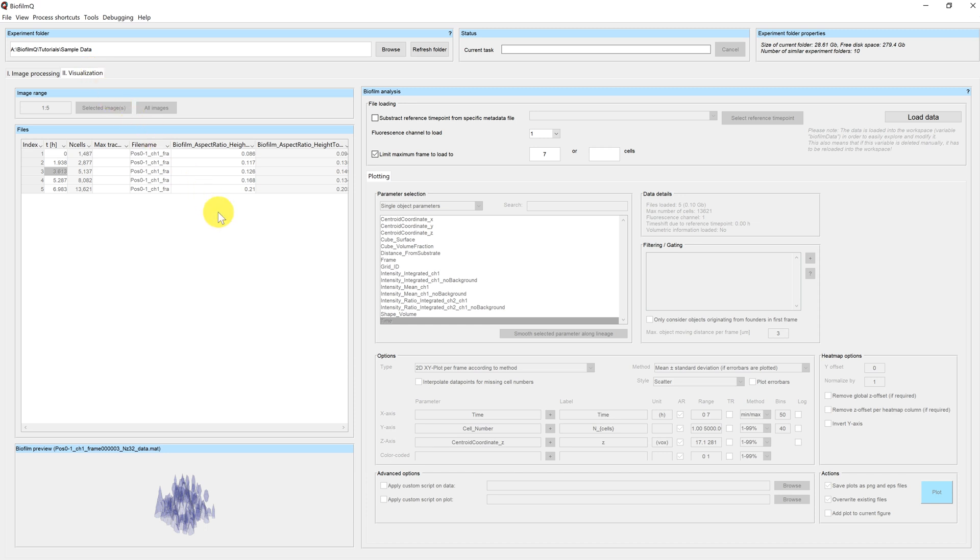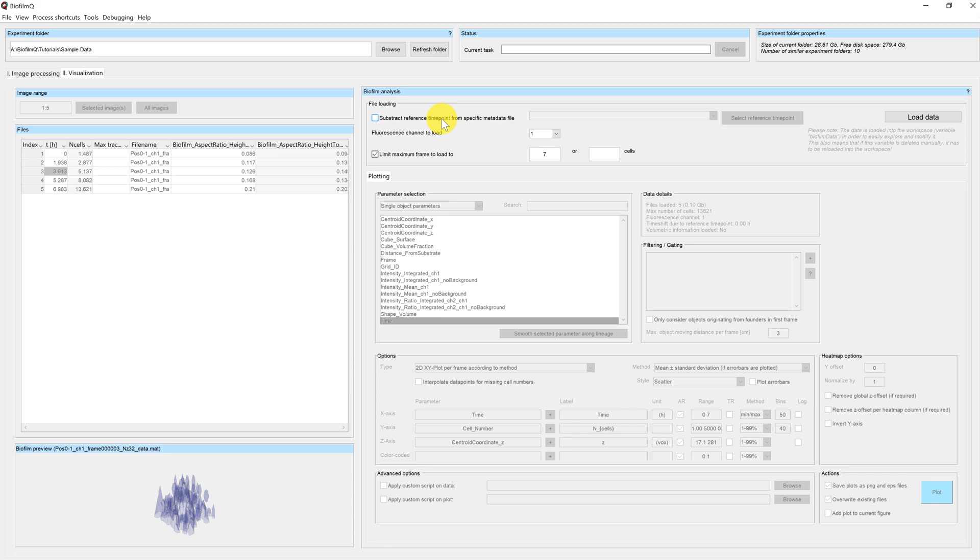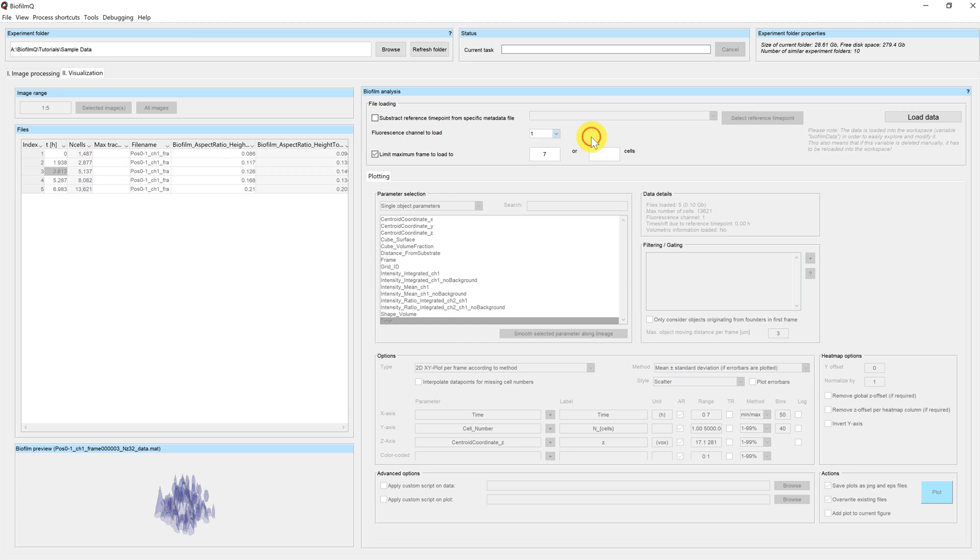Before you can start working in this tab, you first have to load your data. You can see that I have different options for loading the data. I can subtract a reference time point in case that I have split my experiment into different folders, but I want to have the time point referring to a previous or different folder. I can choose my fluorescence channel to load. In this case we load channel one, because channel one is the channel that we have segmented.